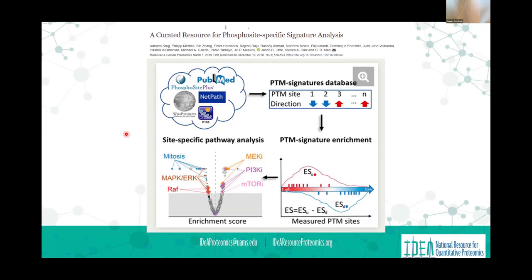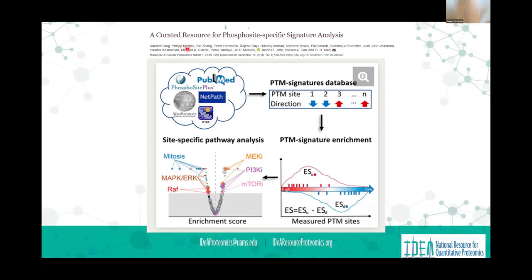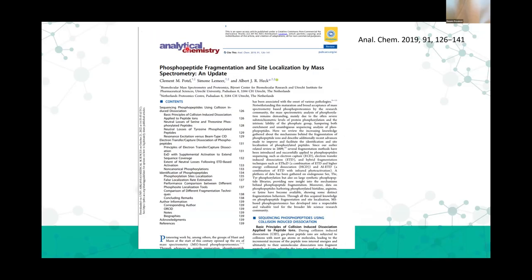So, a small sample set. You may have 100 samples that you're able to do. I don't know what that limit is, Dennis. If you had 100 samples or a time course or a dose response that you want to look at phosphorylation, that's really difficult to do with TMT, but with DIA, it's a much better fit. We can do that.